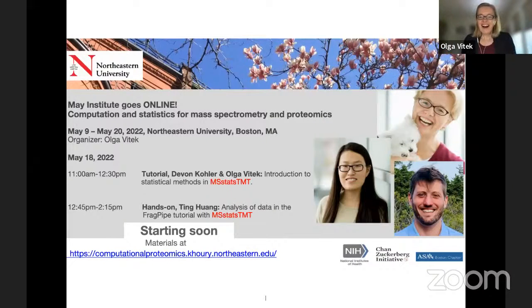Okay, welcome everybody back. This is day 9 of May Institute on Computation and Statistics for Mass Spectrometry and Proteomics. We are very happy to see that you are staying with us. I hope you are not too exhausted yet. We have some really interesting topics left for the next 3 days. Today, we are going to talk about statistical analysis in MSstats, specifically for quantitative experiments with TMT labeling. So I hope that this will be of interest to you.